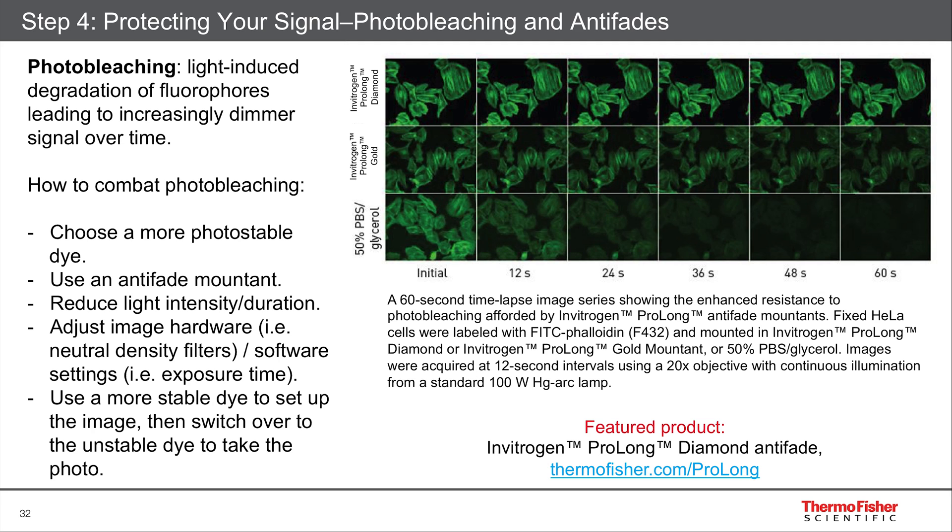Remember, your hardware settings play a role too. Exposure time — the longer your exposure time, the more photobleaching you'll get.